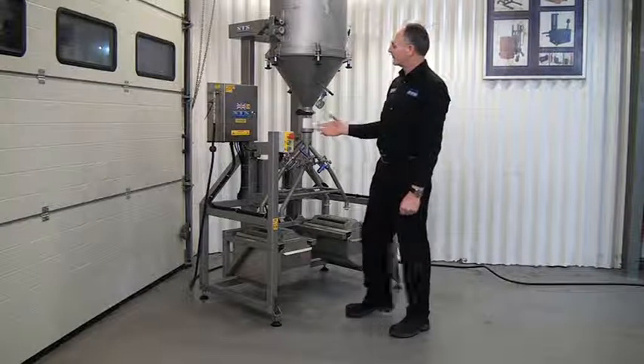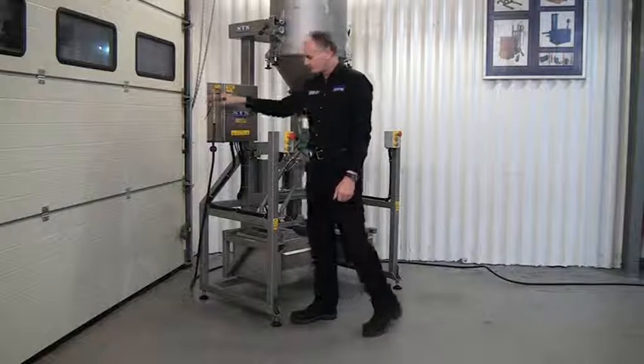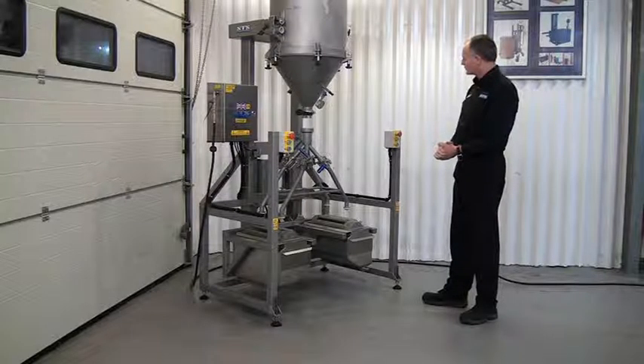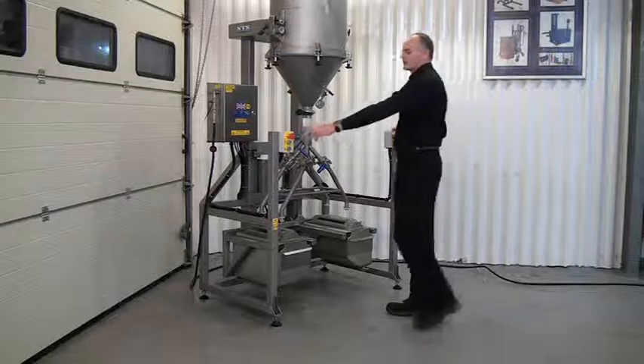This unit is air operated, so we plug an airline into the left hand side here and switch it on. We have a few safety functions on this unit on the control, so you have to operate the right and the left hand control at the same time.